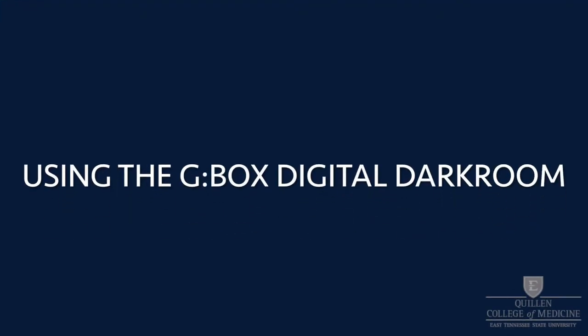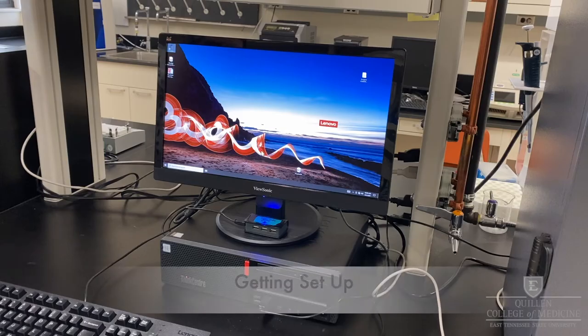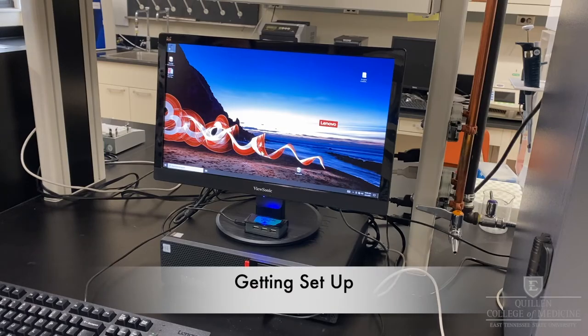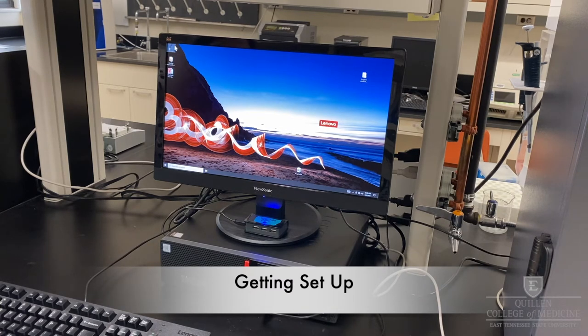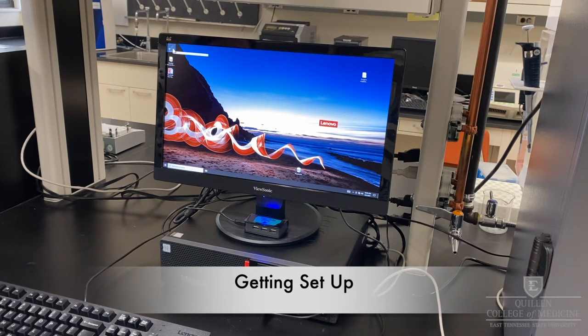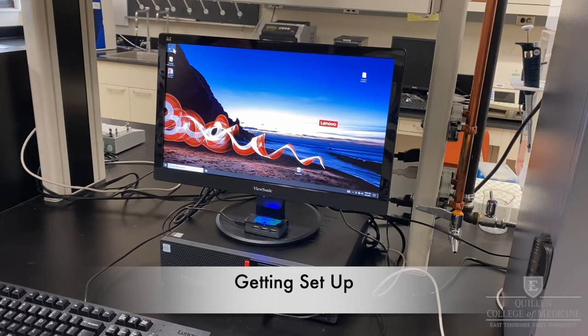Using the Gbox Digital Imaging System. The Gbox is controlled using the Syngene GeneSys software on the computer to the left of the digital darkroom.